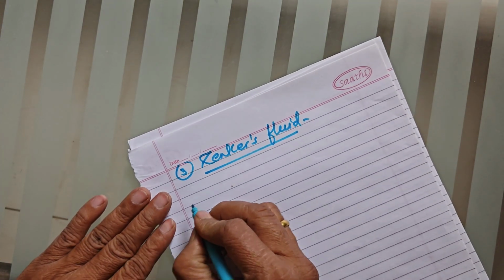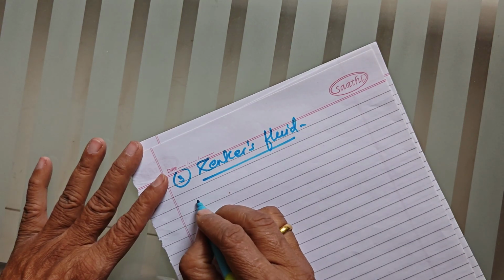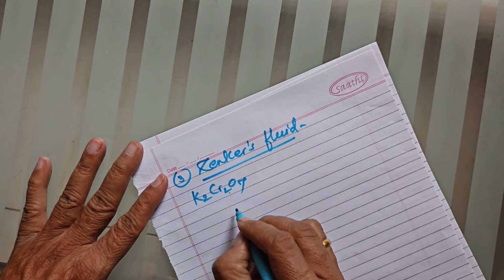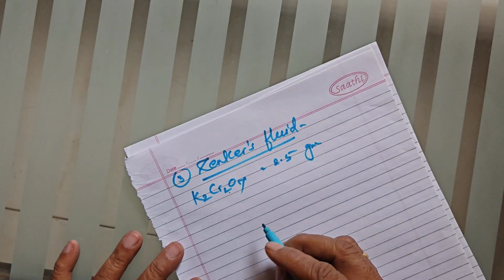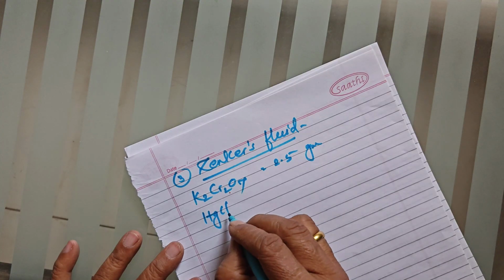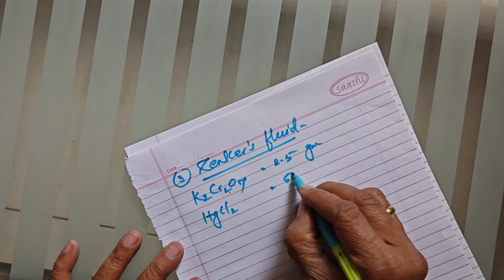The formula of Zenker's fluid is: take potassium dichromate, K2Cr2O7, 2.5 gram. Then mercuric chloride, HgCl2, 5 gram.